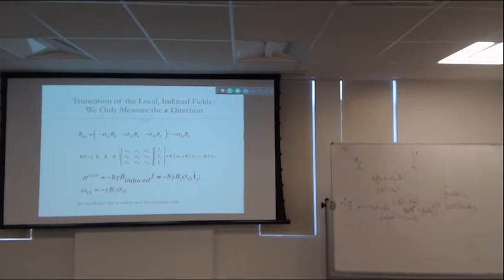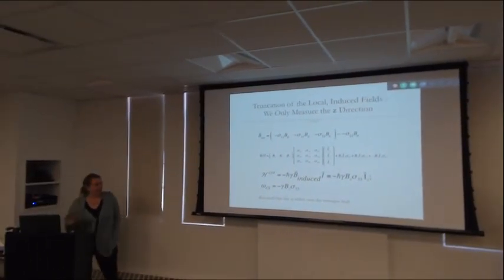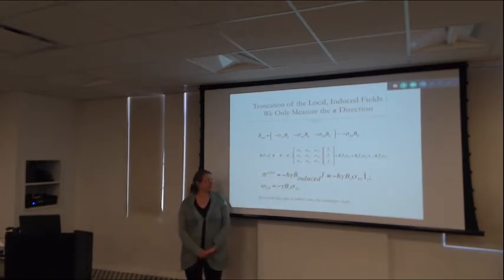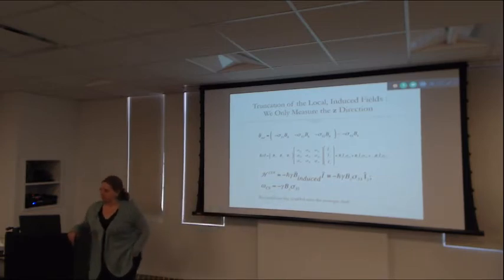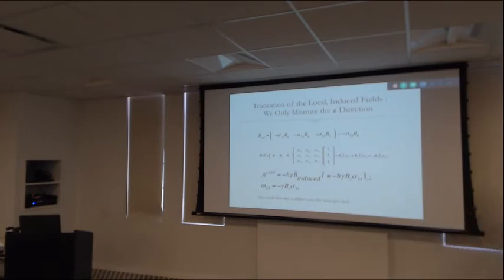So we're getting rid of these other two terms from the CSA because we have no reason to think they would ever be resonant. Now we have that really simple equation. Instead of the isotropic shift in solution, sigma iso, we'll be measuring sigma iso plus sigma 3,3 in terms of the proportionality constant for B naught. Okay, so B naught for the solution NMR experiment is not just B naught Iz like the Zeeman term, but you get this other term that's B naught.